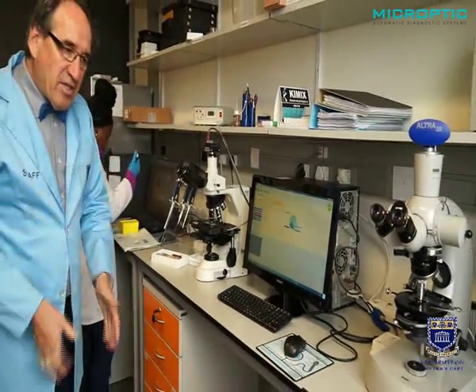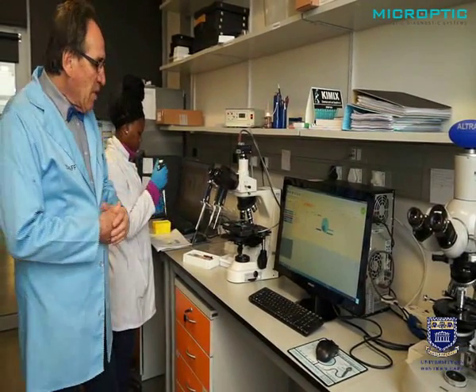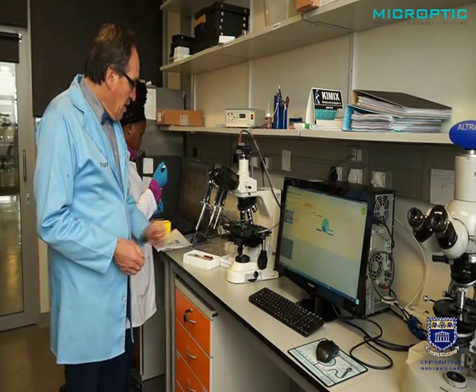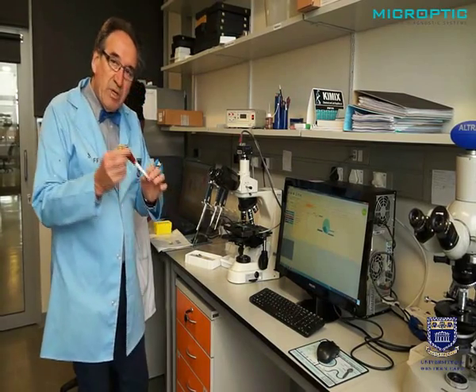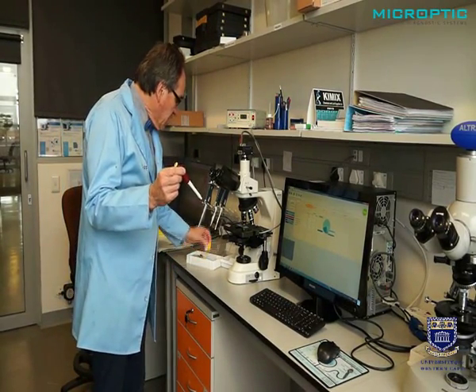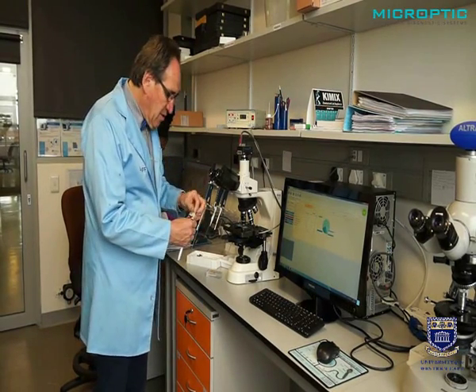What is next required? Of course, in order to work with semen, you need to have a really good pipette set. When you do sperm concentration, you actually need to work with a positive displacement pipette. In this instance, there is no negative pressure created.